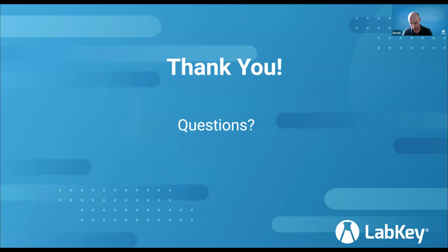Key points to evaluate. Okay, so this is where I really emphasize trying to perform your process in the system as part of this hands-on. There may be some basic configuration required, and during a trial or demo period, it's perfectly fine for you to describe it and have the vendor configure it for you so that you can step into it, try it, see what it looks like with your data and get a feel for it.